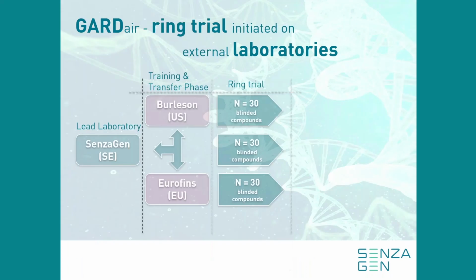So what we currently work on now is basically to perform a ring trial using the same setup as we did on the validation studies that we performed with the GARD skin and the GARD potency assay. So we are currently running this in our external laboratories, and we hope to have this data available in the end of the year.